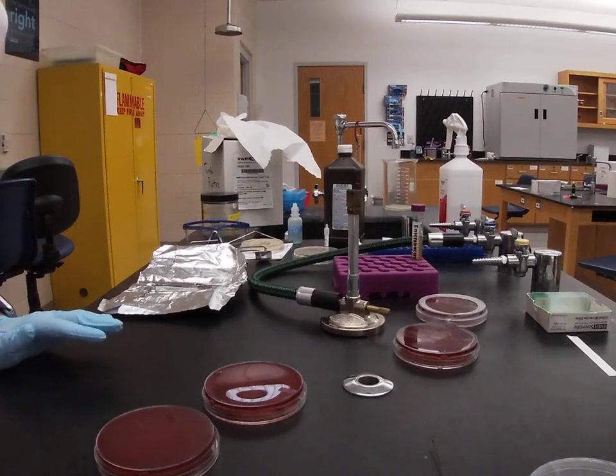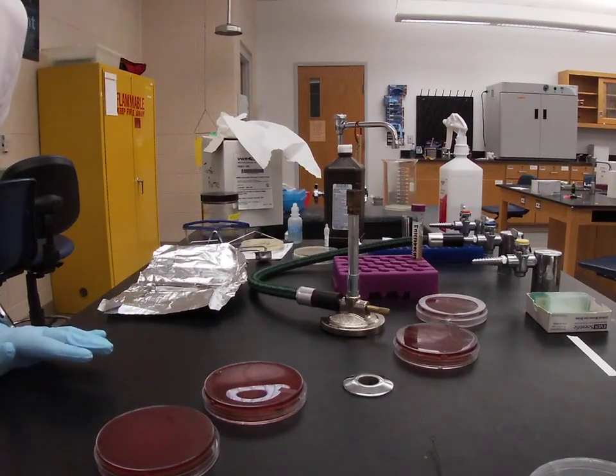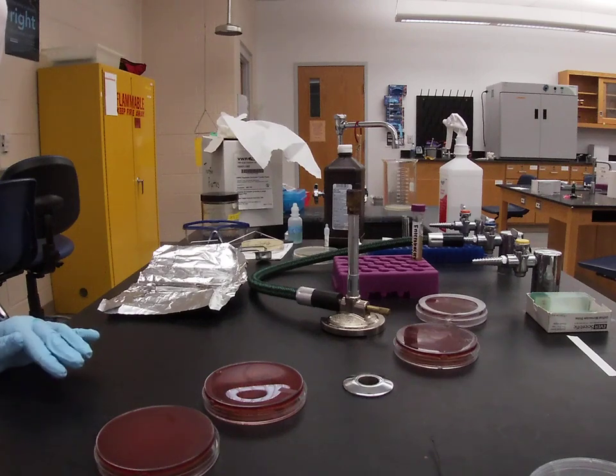In this video, we are going to talk about blood agar. Blood agar is also known as tryptic soy agar that is supplemented with 5% whole sheep's blood. And blood agar is an enriched media. It is just like nutrient agar.